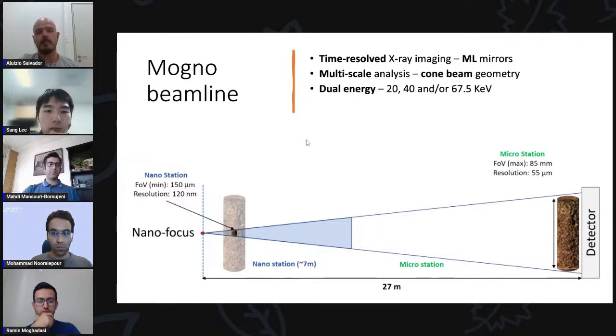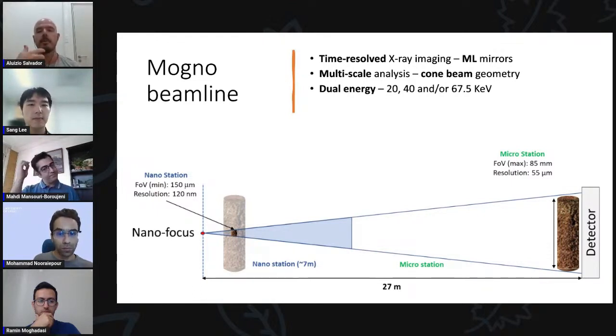Also, with a fast acquisition, we can perform tomography images in seconds. And as Daphne also mentioned, we can follow in time determined reactions, having many tomographies, for example, every 10 seconds, and see the evolution of a reaction. For us, specifically the mineralization process, where we want to see the microstructure changes induced by the carbon dioxide, would be very interesting.